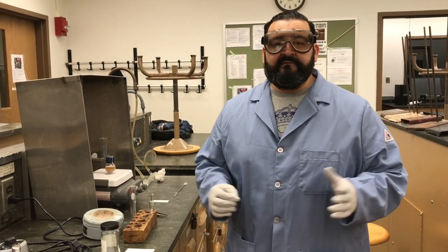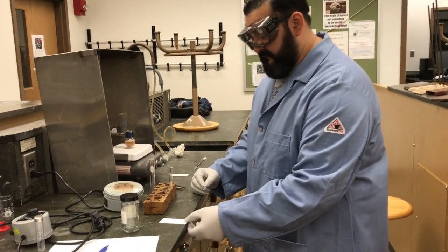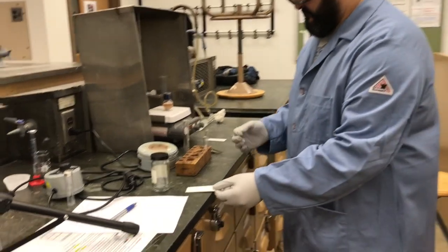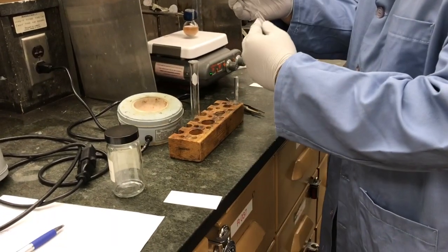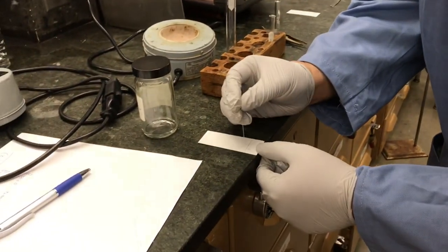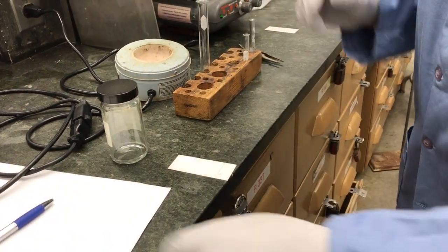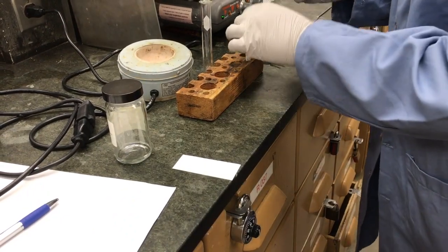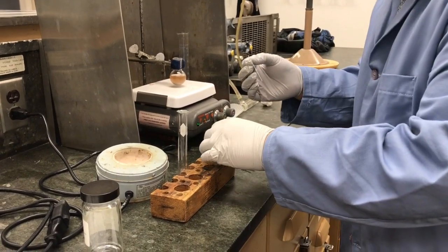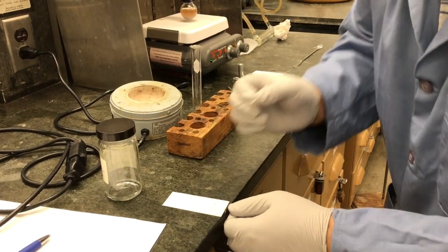So hey everyone, we're going to do the TLC for part 1, which is the reduction of our aldehyde. Here on our TLC plate, like Rashmi showed you, we have A and B. A is our benzaldehyde, our starting material, so we're going to take that and spot here. That should be good enough. And next we're going to spot our product, our reduction, our alcohol. That should be enough.